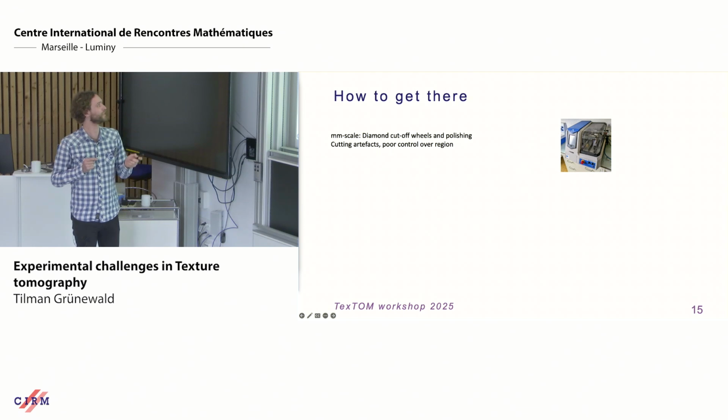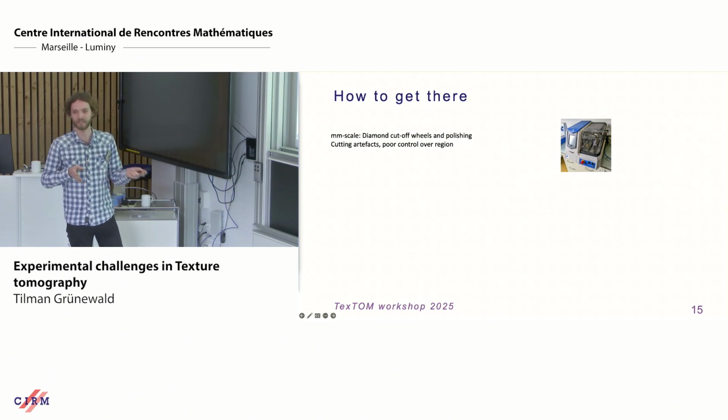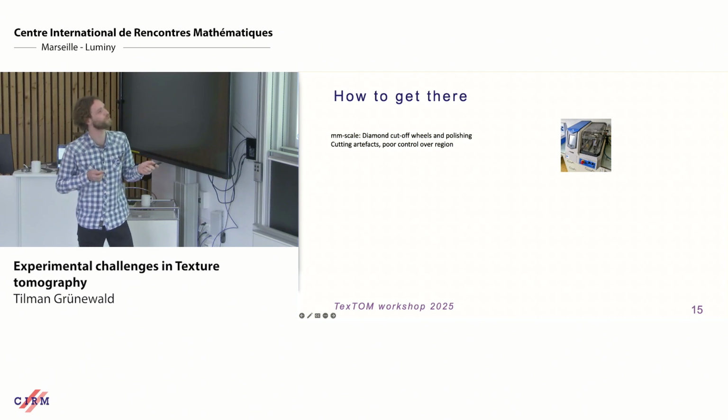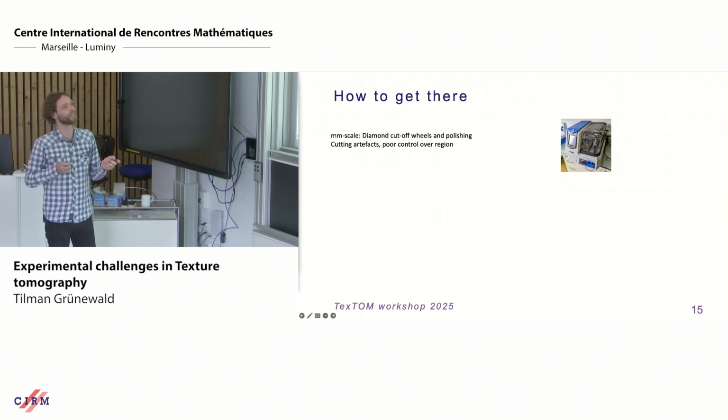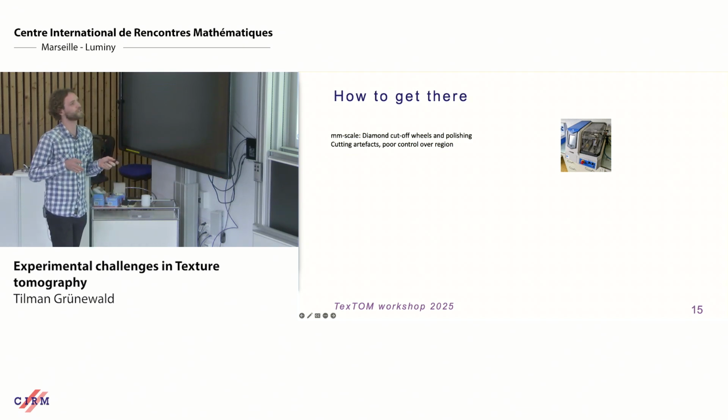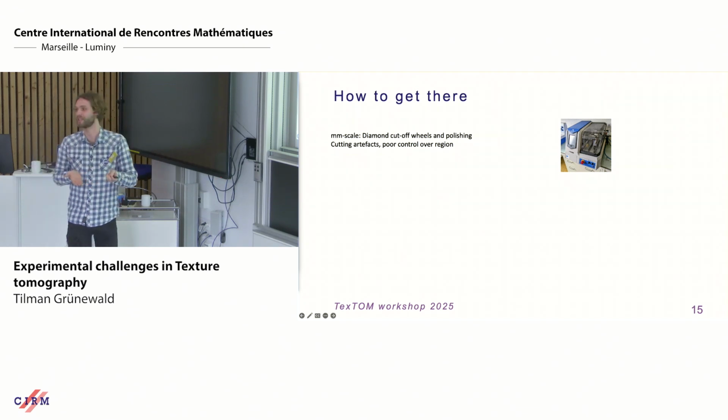How to get there? I mean, the easy way for millimeter-sized samples, you just cut them with these diamond cutoff wheels. You can cut millimeter-sized samples, no problems. The problem is that you're not really selective to where you're cutting.